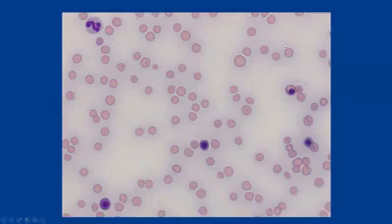The first thing I'm noticing with my red cells is there's a lot of white spacing in between them, and that is fitting with the marked anemia in this patient. There is some variability in red cell size, this cell compared to that cell. But I'm not seeing what's called polychromasia, which is indicative of immature red cells, which I will cover in a case later. So we're not going to focus on that right now.